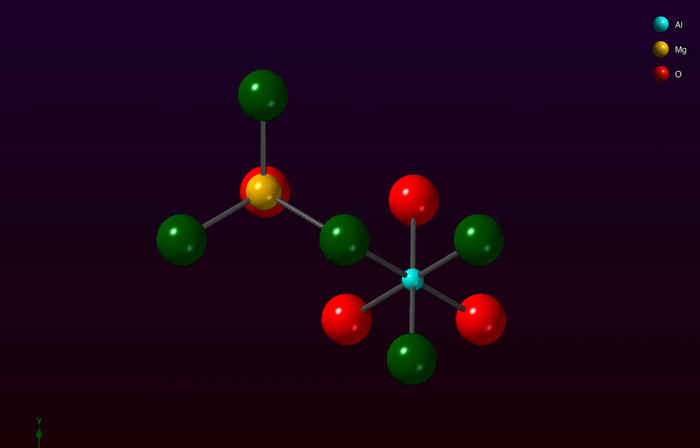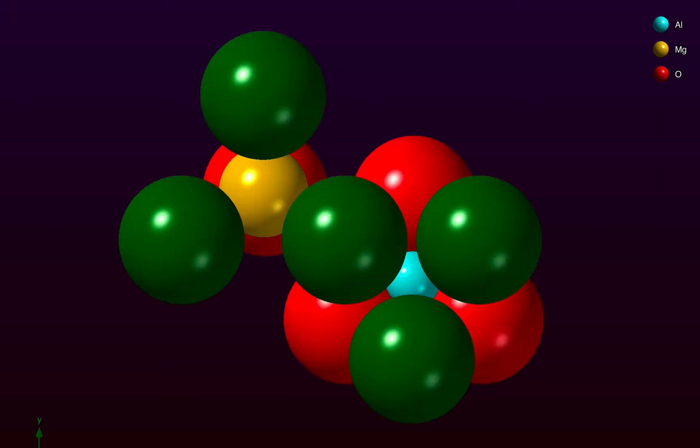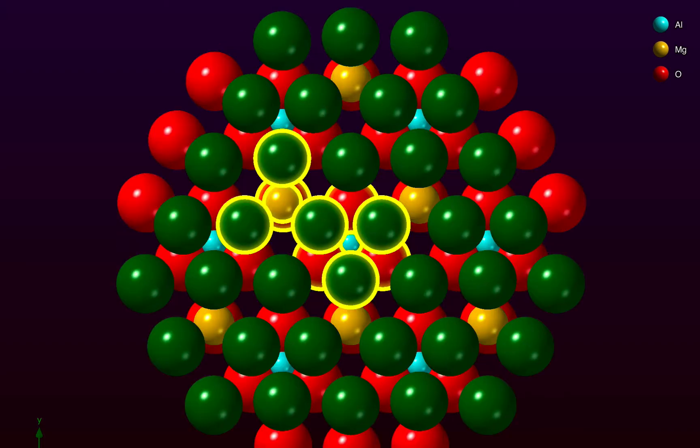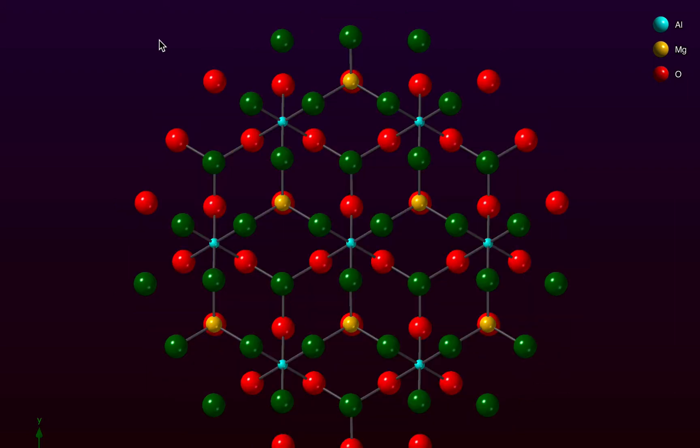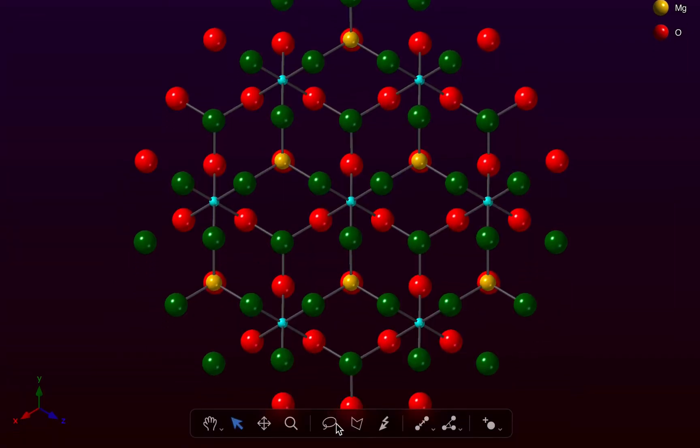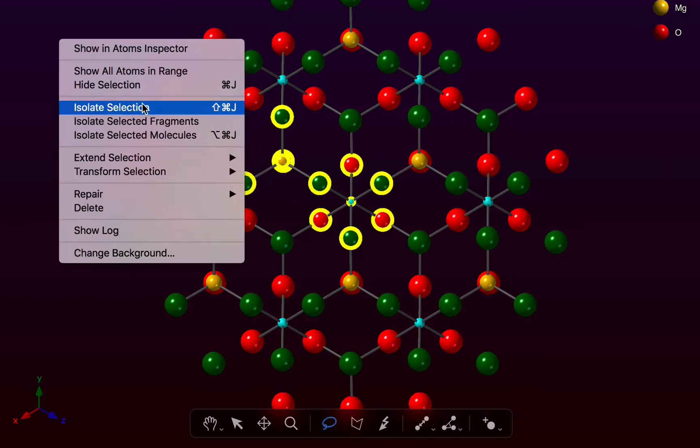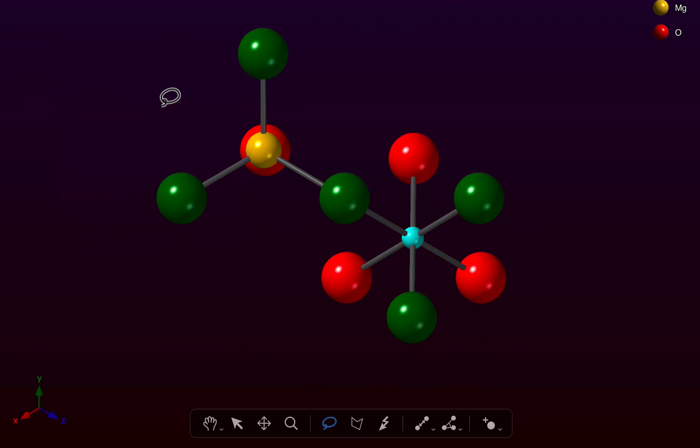Now something else that we could have done is if we go back we can use our undo command and switch to a ball and stick plot. We can use the lasso tool to do the same thing. So we can draw around areas of interest with the lasso and we can use the isolate selection command to show those atoms.